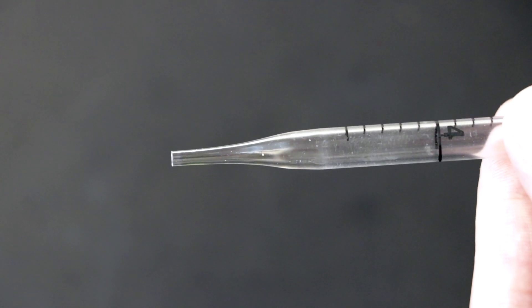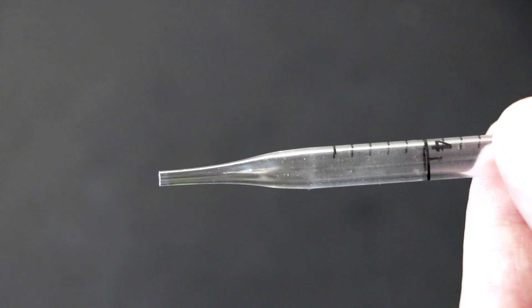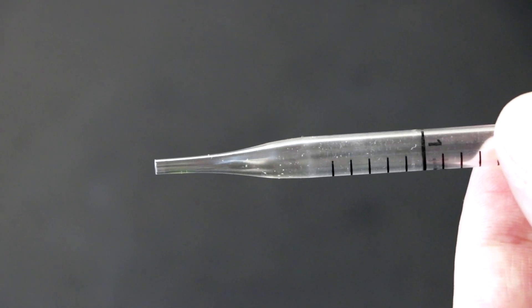The 5 mL mohr pipette has two scales on opposite sides of the pipette. We will be using the scale with smaller numbers.